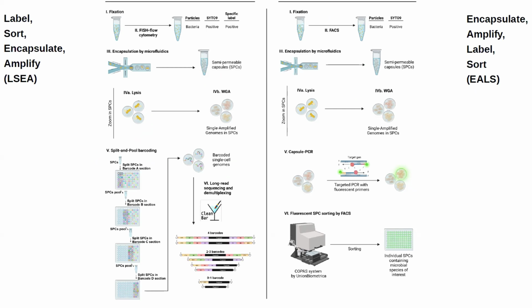These fluorescent primers can be used like in a normal PCR, but here you apply this PCR to the tube in which you have your capsules, and after this PCR you obtain a lot of fluorescent amplicons. These amplicons generate a lot of fluorescence, and then you can go to the flow cytometer and collect the cells that are fluorescent. Obviously you don't want to collect 10,000 cells, because you could not do sequencing of 10,000 individual wells. But if you are interested in some small scale sampling, you can collect, I don't know, one plate and sequence them separately, as I mentioned, by multiplexing on the Illumina platform and so on. So depending on your objectives, on your throughput, and on which kind of fluorescent labeling you prefer, you can choose one or the other workflow.